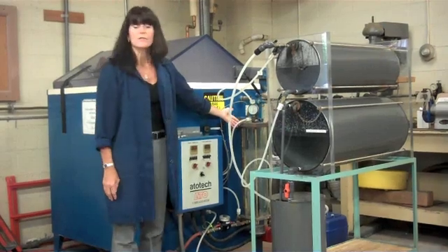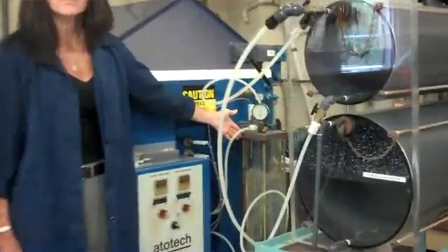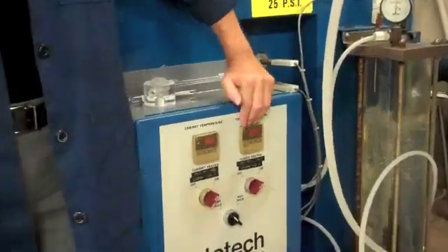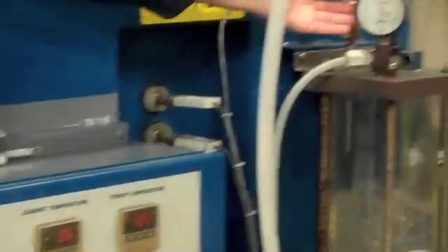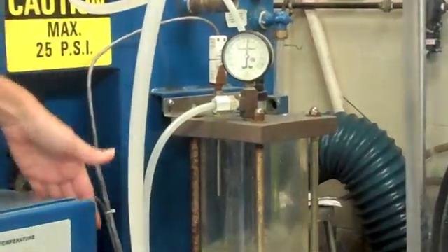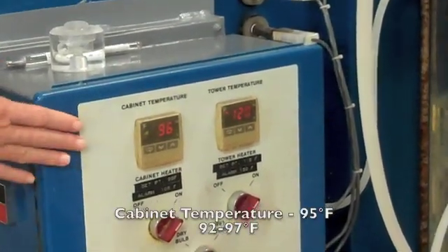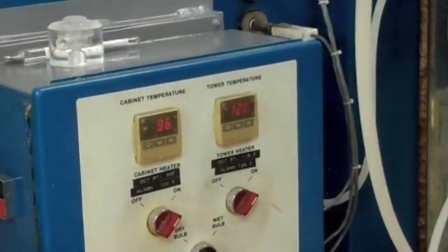Next we're going to look at the air saturation tower. What we monitor here is two things: we look at the tower temperature and we look at the pressure within the tower, which helps us maintain an even fog within the cabinet. Tower temperature today is 120 degrees — typically it runs between 114 and 121 degrees. Spray pressure today is 16 and our pressure range is typically 14 to 18. The tower temperature runs a little hotter than the internal cabinet temperature simply because there is a cooling when the salt solution is aspirated.